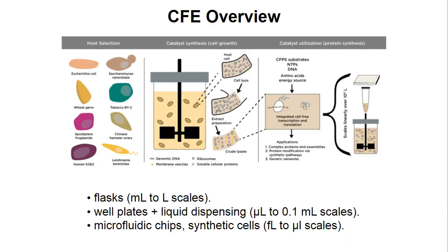Cell-free gene expression systems are prepared from living cells. Typically, the first step consists of choosing a type of cells. In many cases, it's Escherichia coli. The cells are grown in a culture flask, and a lysate is prepared by breaking the cells and isolating the liquid part of the cell, or the cytoplasm. This lysate contains the molecular machineries to perform transcription and translation in vitro.